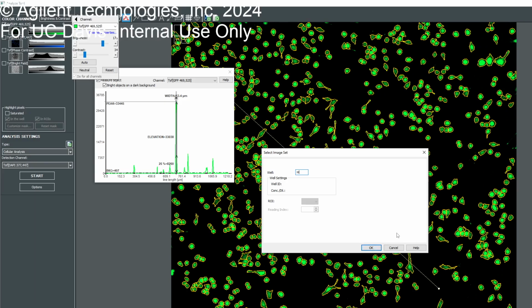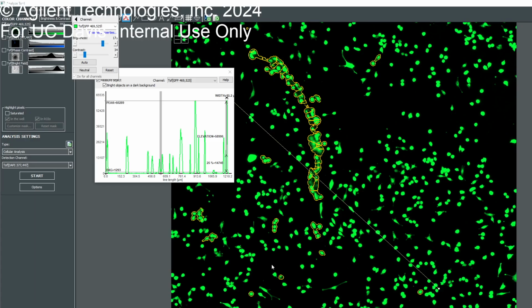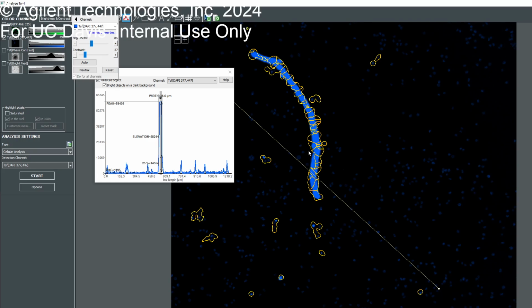I don't know what that is. But if you go back to the DAPI, I don't think we're catching most of it. So we can kind of mark this image as an outlier. That's why. So it focused on this, you see. That's why. It's fine.